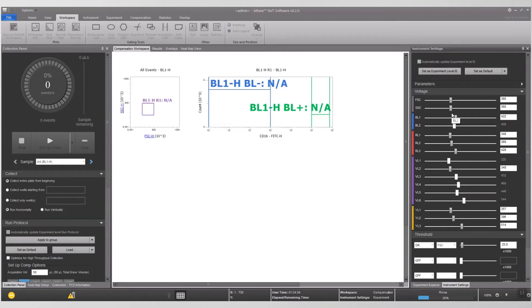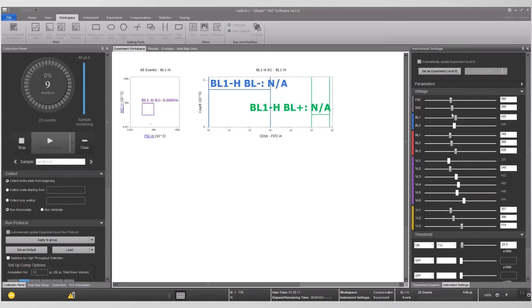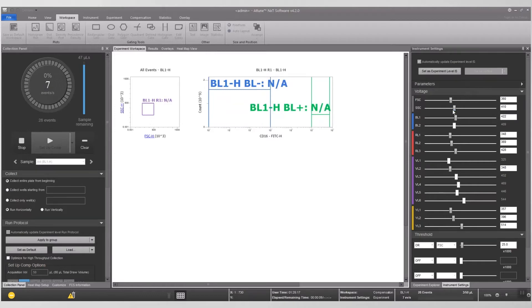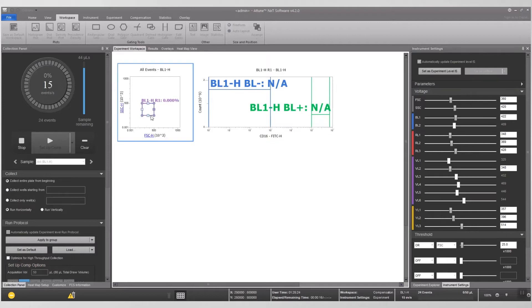If you drag the sliders, you must let go to refresh. You can also use the keyboard arrows, the wheel on the mouse, or type in the box to change the voltages. Start with the forward scatter and side scatter. Adjust the forward scatter and side scatter gate to include the beads, then right-click on the gate to apply to all controls.